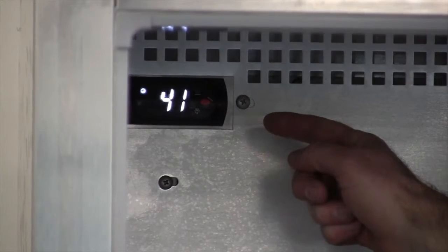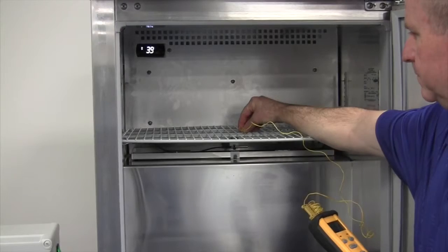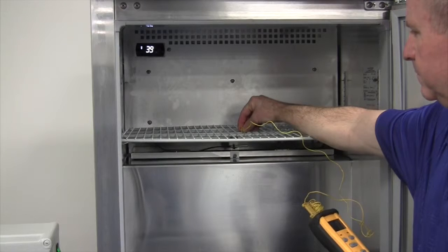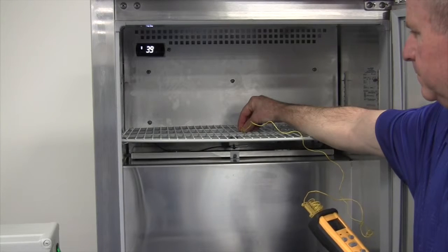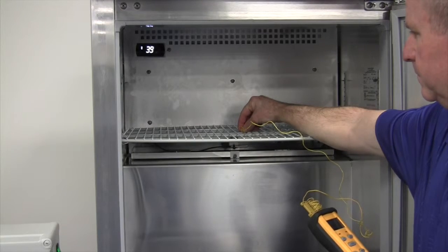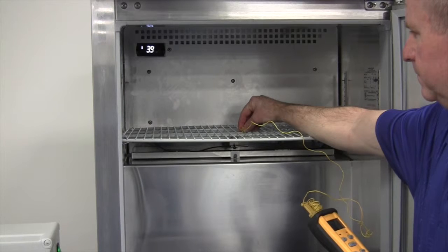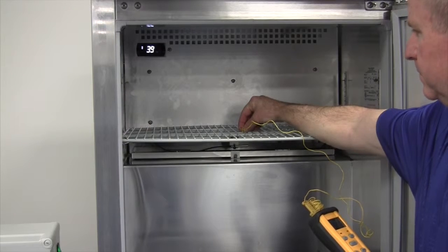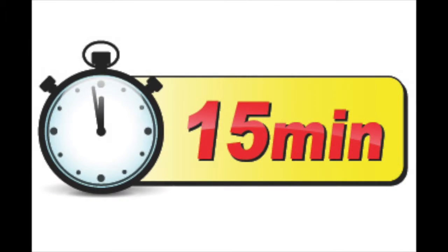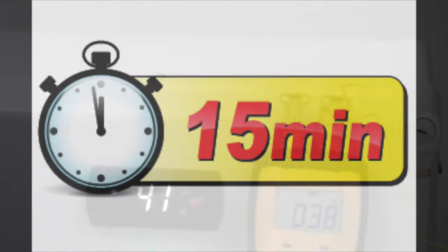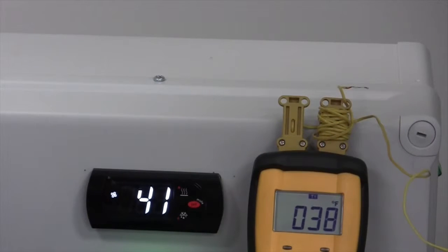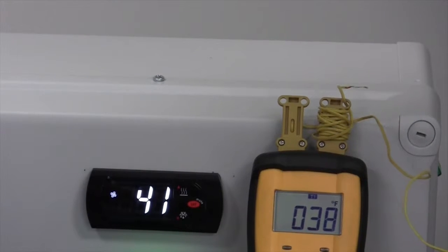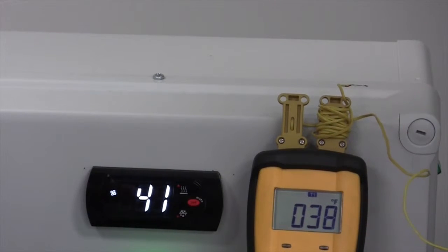Before attempting to calibrate the temperature display, check the display by placing a pre-calibrated temperature sensing device in the center of the refrigerated compartment and keep the doors closed for 15 minutes. The temperature should read the same as the sensing device, within 2 degrees.